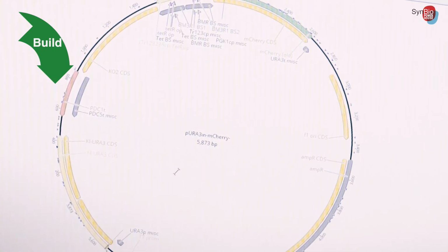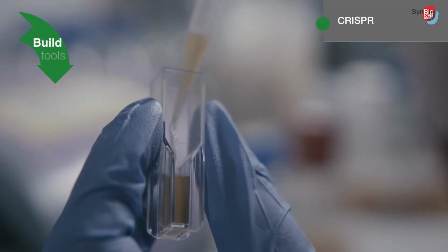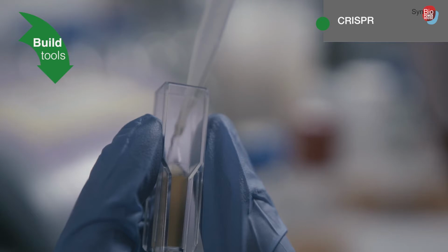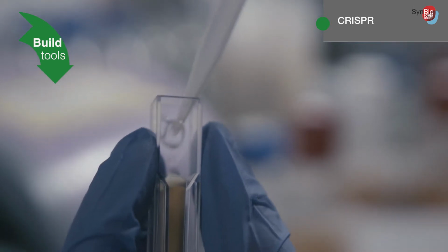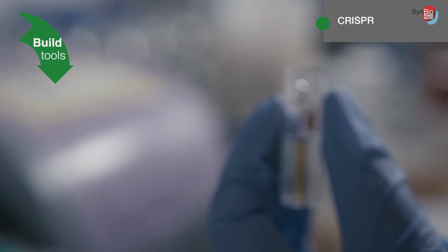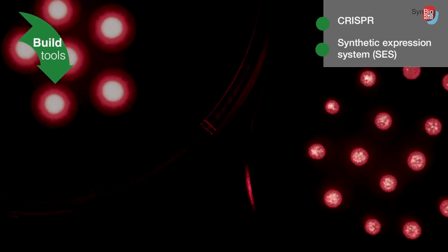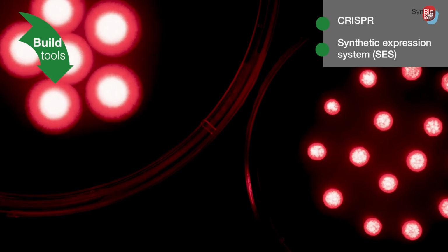There are huge options. It's fully synthetic DNA, so you can actually order it nowadays. There are companies making this fairly cheap, so you can order whatever DNA sequence you want, and they will deliver DNA of your choice in a small tube. Once parts are assembled, there are several gene modification tools, such as CRISPR, to edit or insert the foreign genes into the host organism.